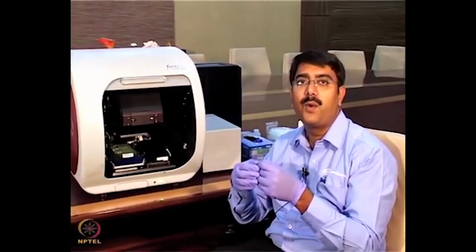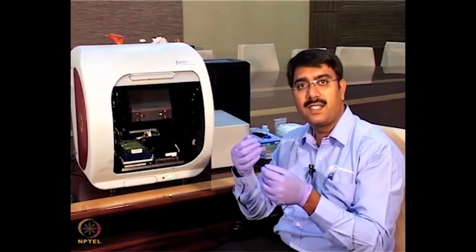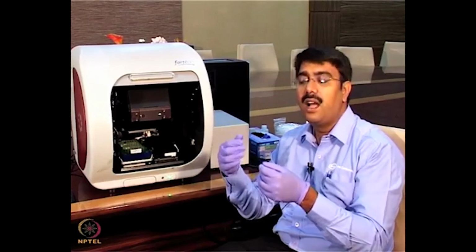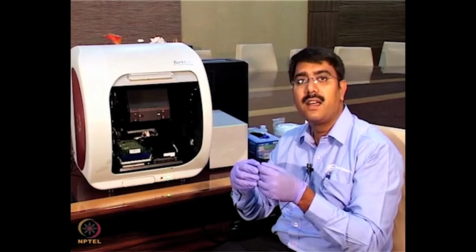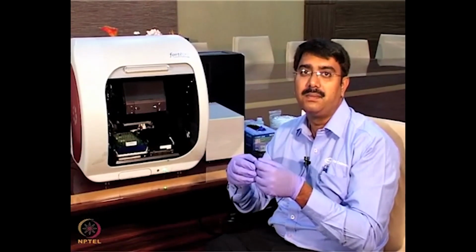Suppose, in industry or for any protein, you want to do a quantification, we can directly take known concentrations of standards, generate a standard curve, and from it determine the unknown concentrations. Apart from that, the major use of this instrument is to study binding kinetics, where we determine the rate constants like the on rate and off rate, as well as the affinity constants.